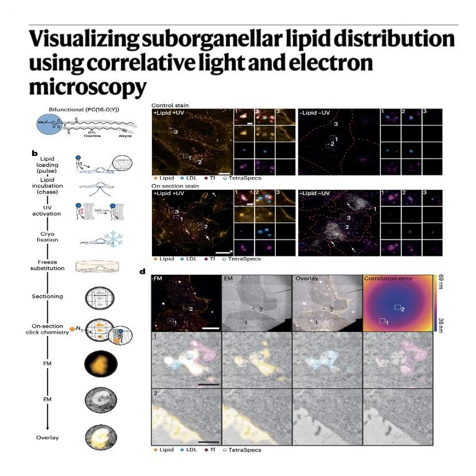Okay, but if our goal is to measure the 3D volume and density of the lipids, we have to switch to the second resin, K11M. Exactly. K11M is a polar resin, so the click reagents easily seep into and penetrate this matrix. The signal width nearly doubles, jumping to 0.87 micrometers deep. Oh, wow. So when they take fully stained K11M blocks and cut them into horizontal sections, do the fluorescent signals overlap? They overlap perfectly from slice to slice. And this allows for full 3D volume staining, which is mathematically required if you want to calculate actual lipid density inside a structure. That makes sense.